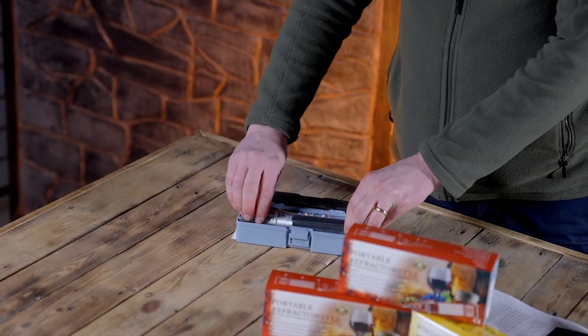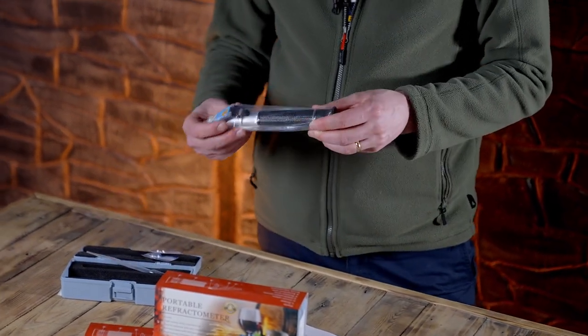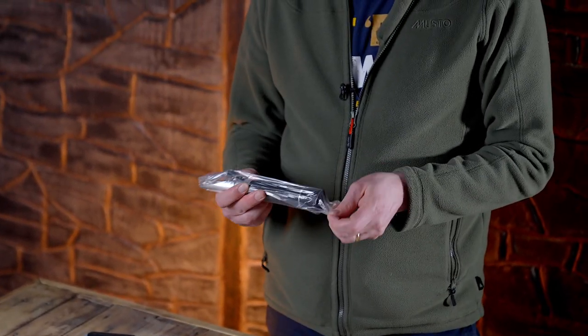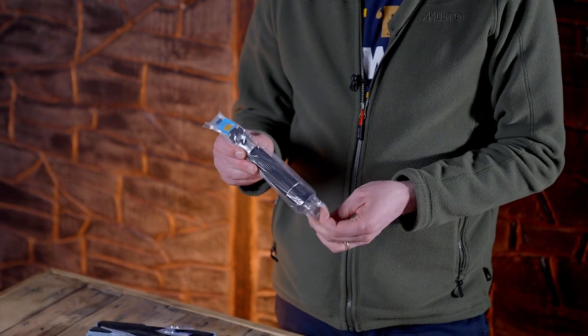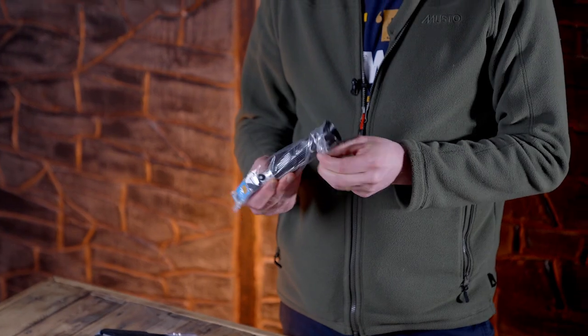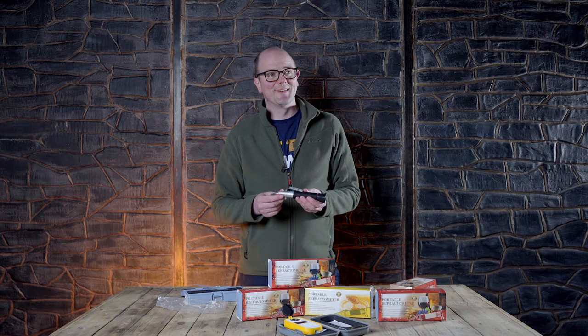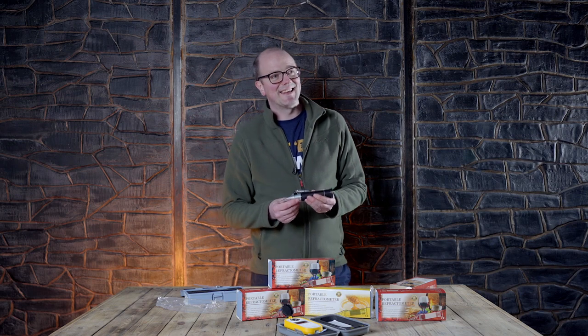So you can see here it comes complete with the batteries and a little pipette. I'll open this one up for you. It works almost like a telescope — this is where you place your sample.